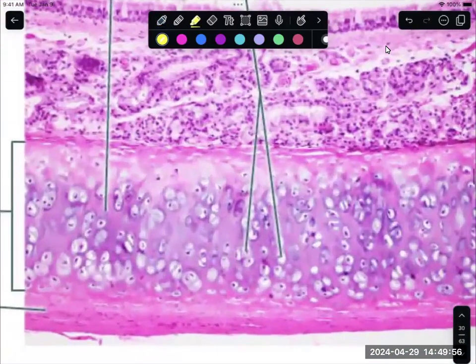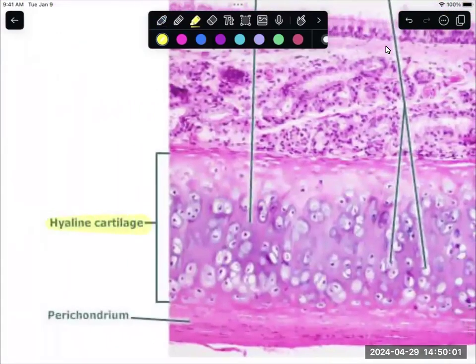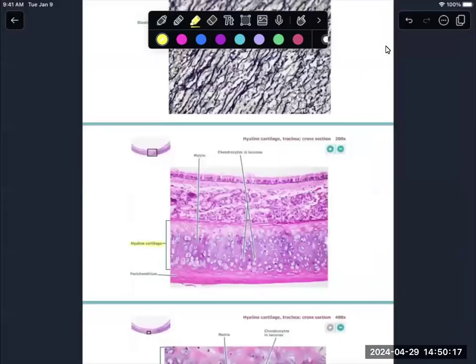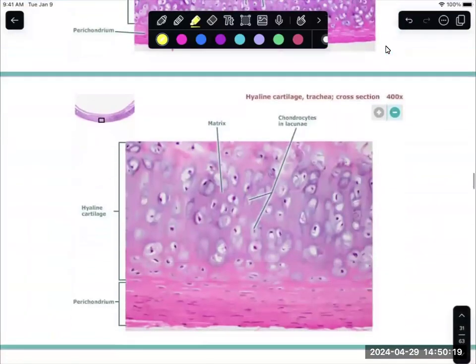Here's that hyaline cartilage. Down here, it's labeled off to the side. You see those white cells. The difference between this and fat cells is these cells are further apart. And here, the nucleus is in the middle of the cell. They're not off somewhere else. Here we get zoomed up closer. You can see those specific chondrocytes, those specific cells. The nucleus is in the middle. And then you have that pink ground substance, that cartilage found around it.